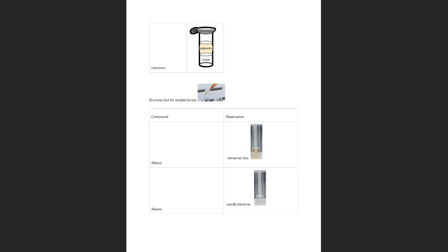You will have to complete whether you have a positive or a negative with the bromine test. So if you look here, you add bromine that is a little orange, or it can be yellow as well. So you will have to know if you did the reaction with an alkane and you see that the color is yellow.